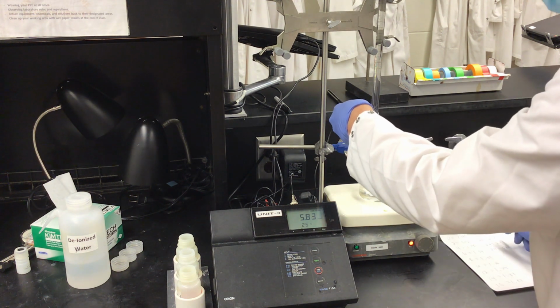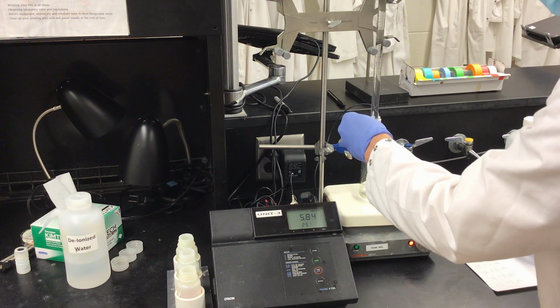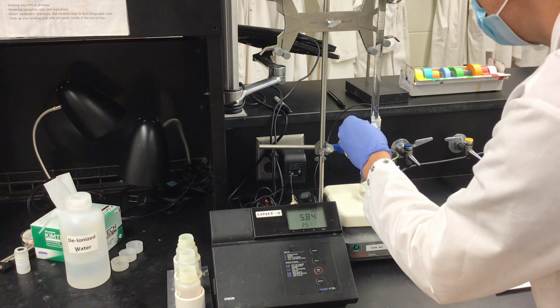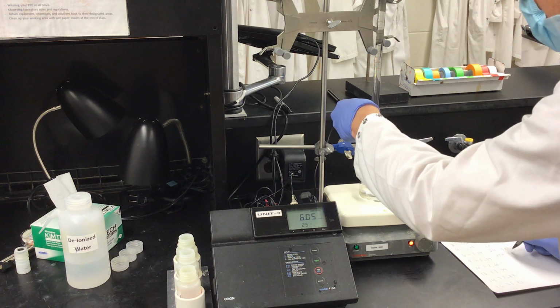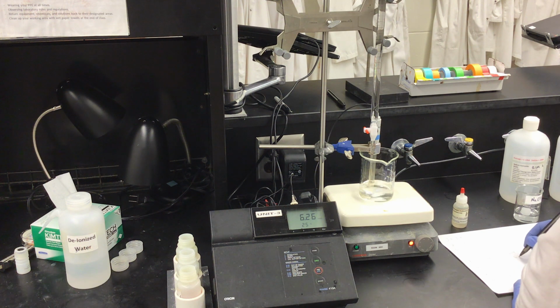So I'm now going to start adding dropwise. I'm going to record my pH about every 0.2 milliliters of sodium hydroxide I add. So at 24.2, I'm at a pH of probably 6.04. We will see what our meter says. Yep, 6.04. Now I will add another 0.2, and now we are at a pH of 6.26.